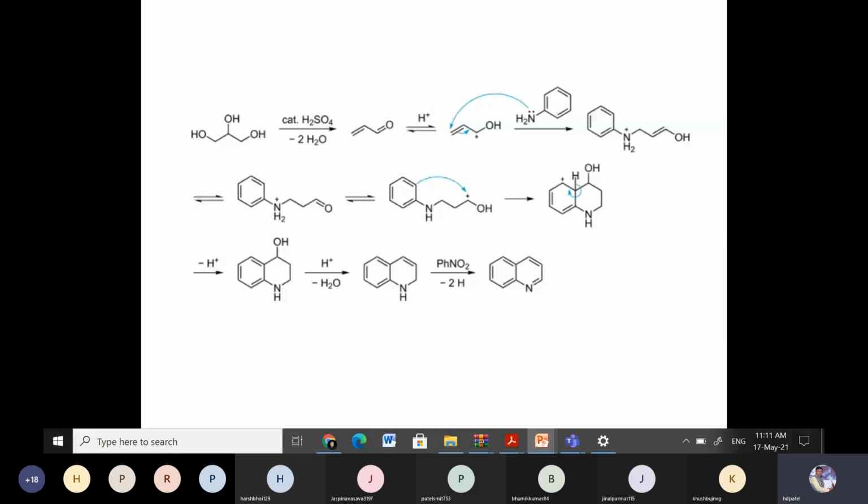So as per the standard procedure we have to go for steam distillation, but in the lab, instead of steam distillation, we can carry out another reaction called the salt formation reaction. In the salt formation reaction we require ZnCl2 and HCl. When we have the reaction mixture, we have to add HCl and ZnCl2.